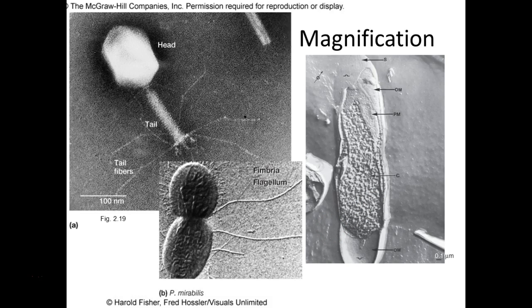The other thing with the images that you get from something like an electron microscope is they tend to be black and white, just like back in the day when we used to take pictures, they were black and white. If there's color to it, somebody's physically gone in and colored the image, either by hand or computer aided, just like they used to color old black and white photos. We do that with the images from electron microscopes so that we can highlight different things we want people to see. Not that the things actually have that color to them. Does that make sense?